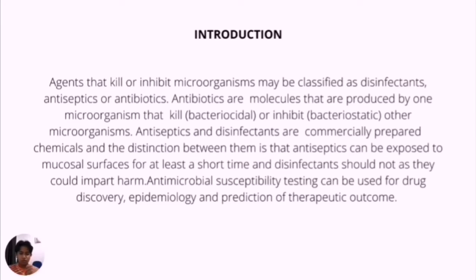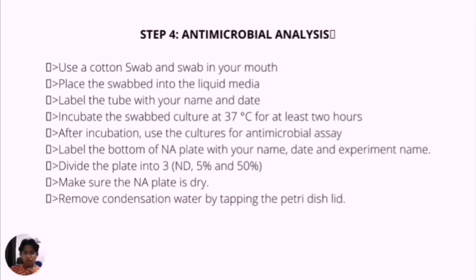First of all, you should use a cotton swab and swab your mouth. Next, place the swab into the liquid media. After that, label the tube with your name and date. It is marked for your experiment. And next, incubate the swab culture at 37 degrees Celsius for at least 2 hours. In this part, longer incubation is recommended.